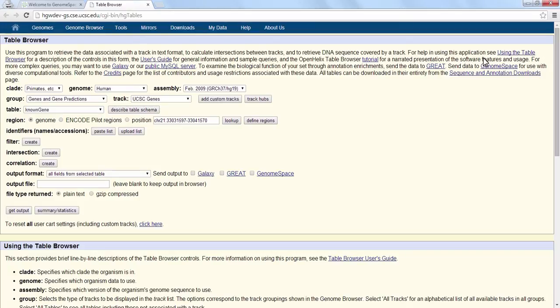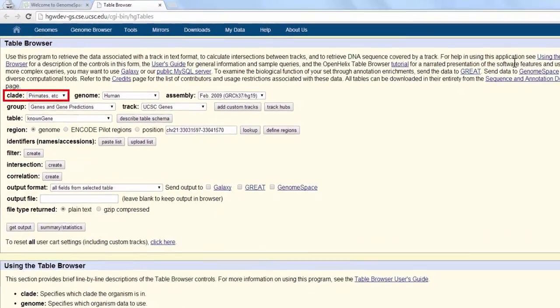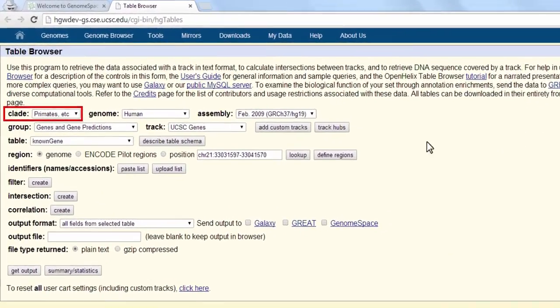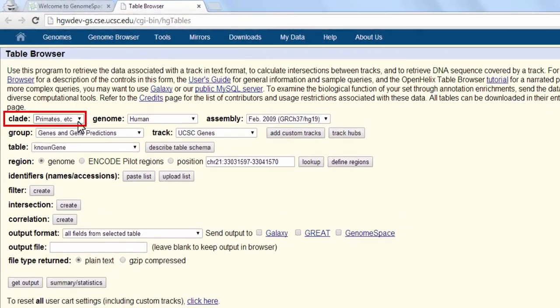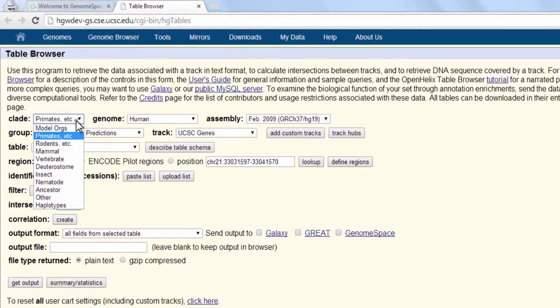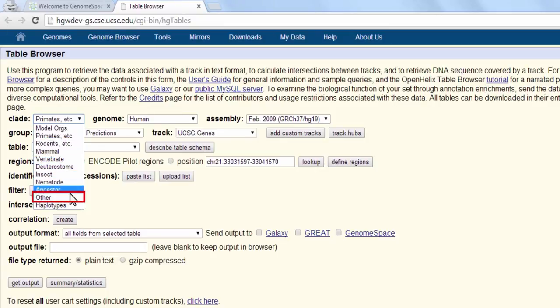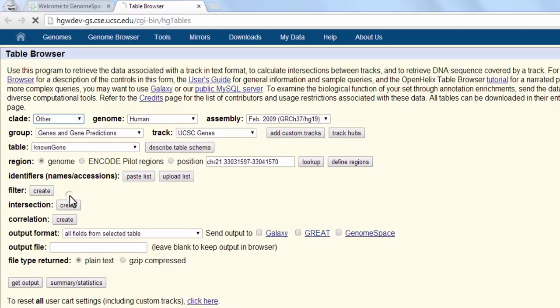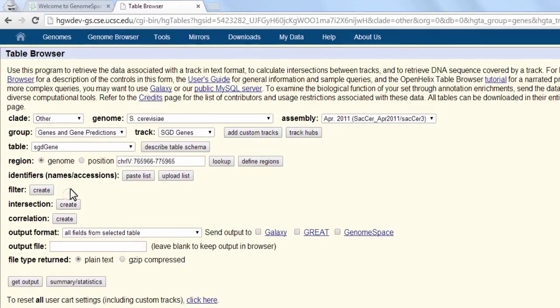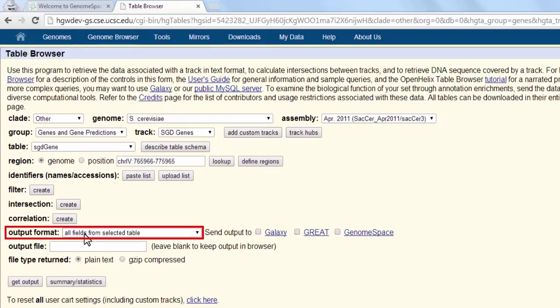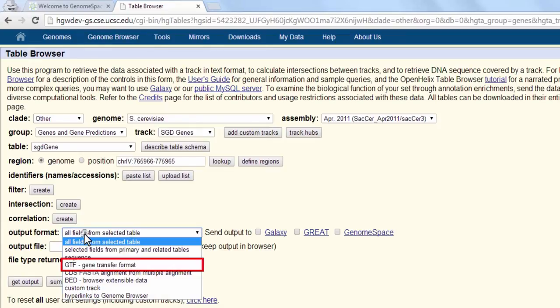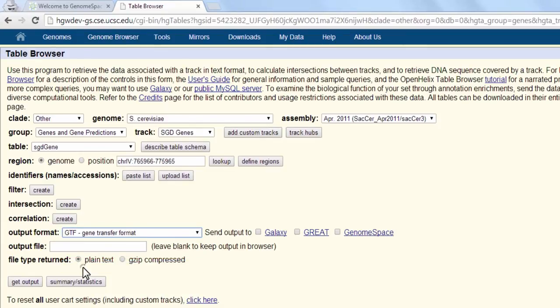To access a specific dataset, we must narrow our search parameters. In this particular recipe, we set the clade parameter to other and the output format to GTF gene transfer format. The rest of the parameters should default to our desired settings.